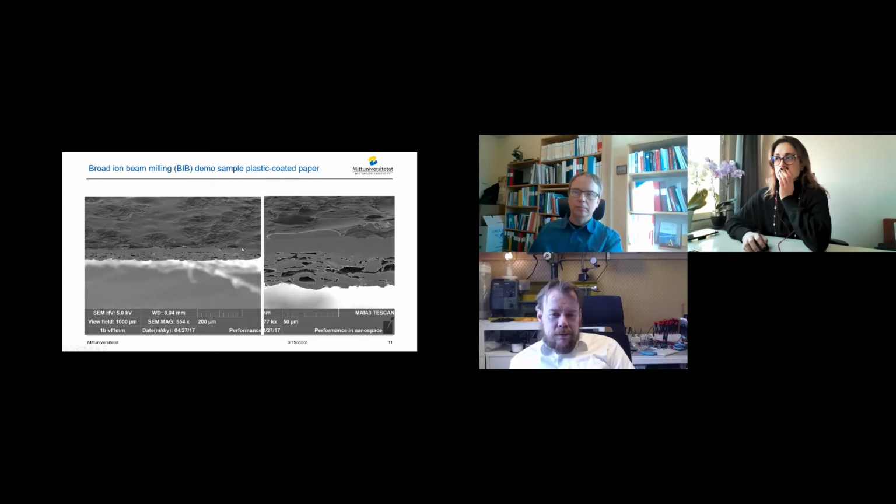And as I said in the beginning, the biggest advantage of this machine is to create high quality cross-sectional areas that are very wide. The left image only shows 1 millimeter. Remember, it is 4 millimeter long. So you have a very, very large, broad cross-sectional view. The left image is still a subset of the real complete full length crosscut.